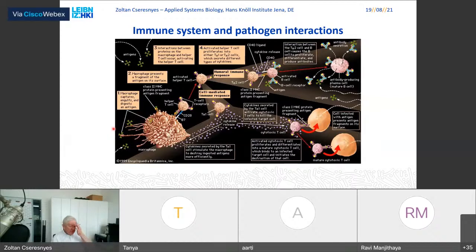That is what we will talk about today, the whole day basically: how do we study and how do we get quantitative characterization about macrophages capturing, eating, and then killing pathogens, especially fungi. And we will base both our talk and the tutorial on confocal microscopy images that monitor the interaction between macrophages and fungal spores.